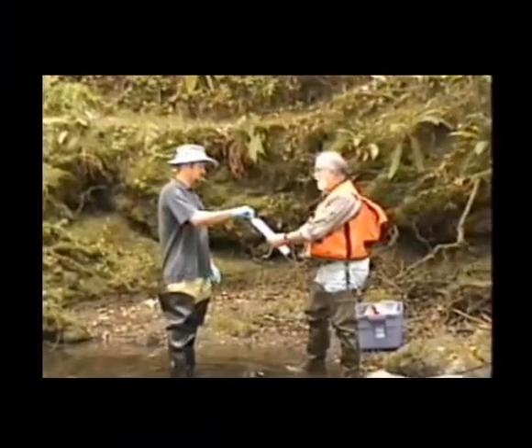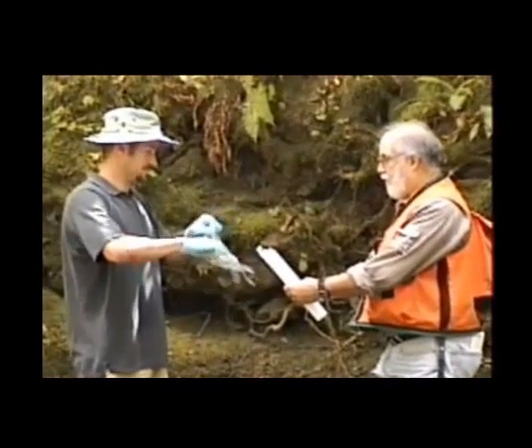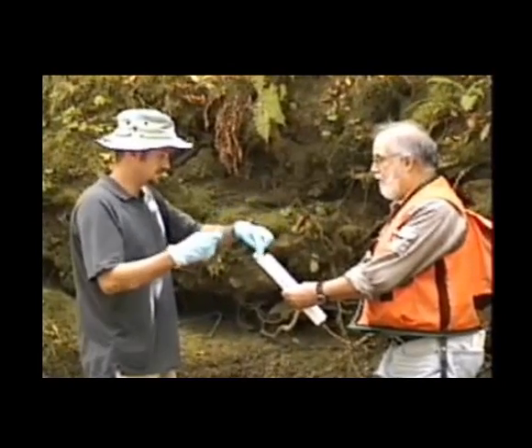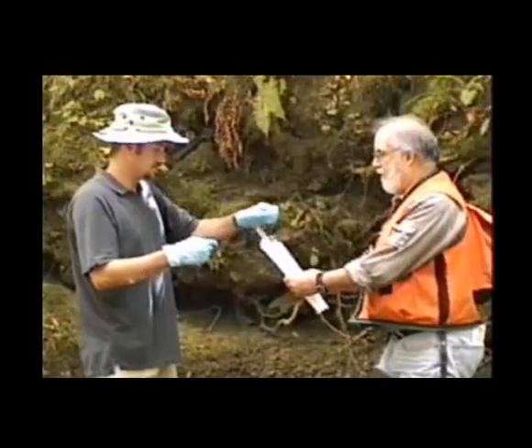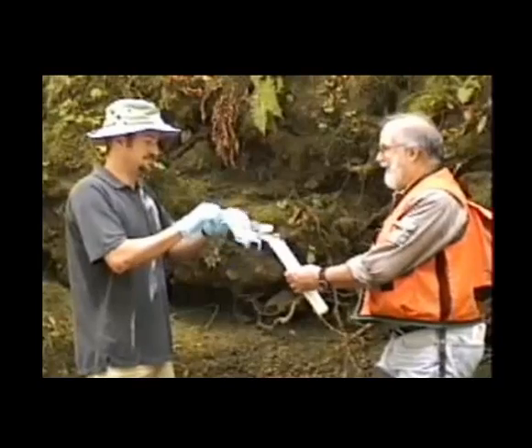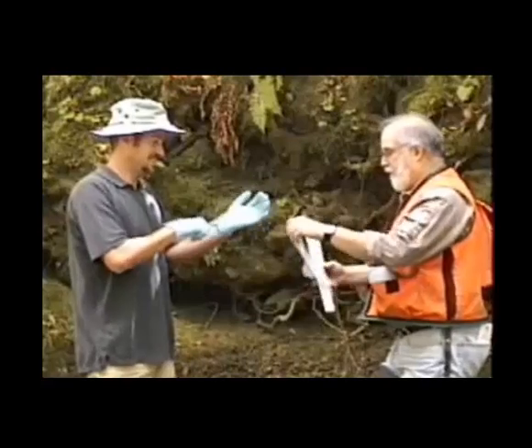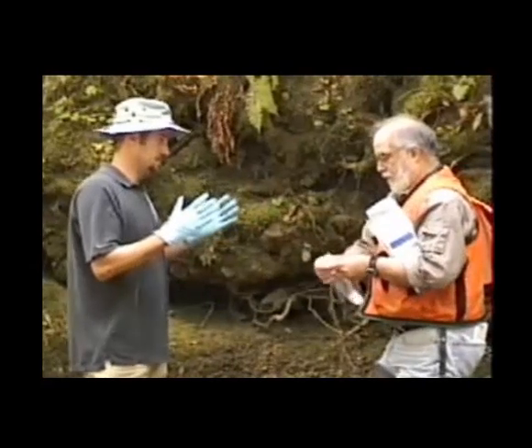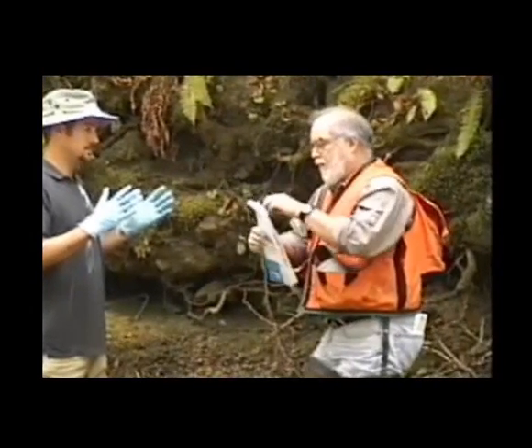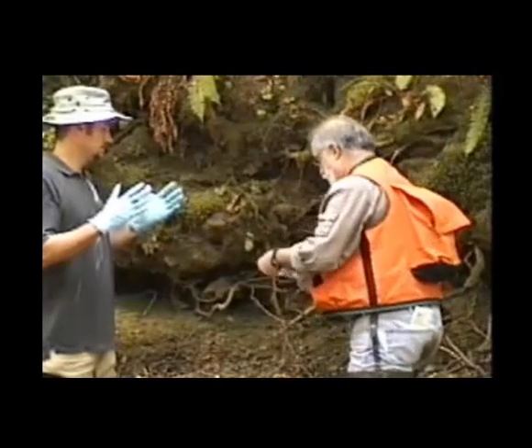In this clip, we will demonstrate the sampling technique known as clean hands, dirty hands. Peter, the sampler on the right, will be dirty hands. Sean, the sampler on the left, will be clean hands. Now, clean hands can touch only the sample container and wears double protection, in this case, 1 set of nitrile gloves and 1 set of poly gloves. Dirty hands requires only 1 set of poly gloves. And here you see dirty hands now donning the 1 set of poly gloves, clean hands on the left, making sure not to touch anything, waiting for dirty hands to glove up.